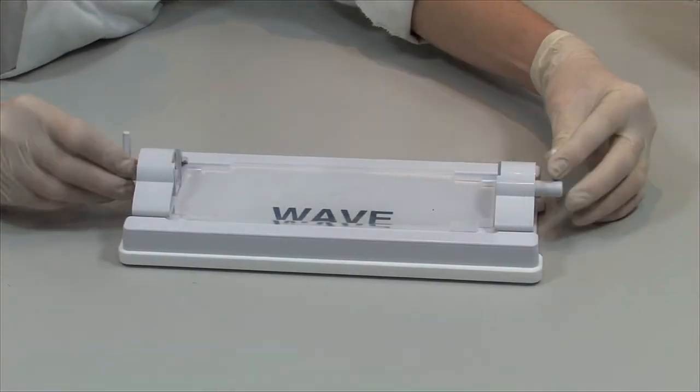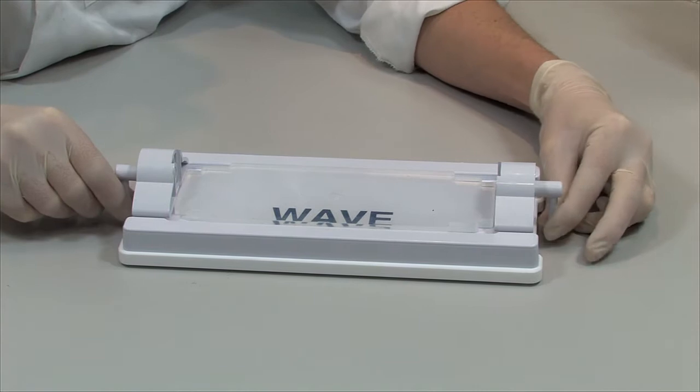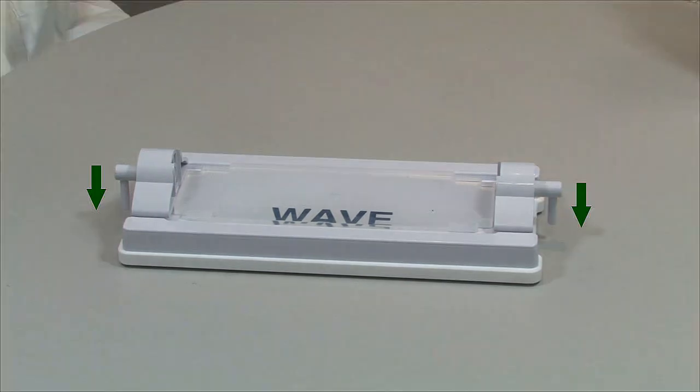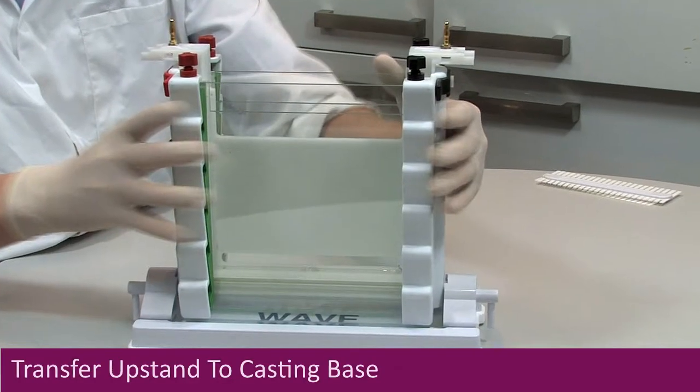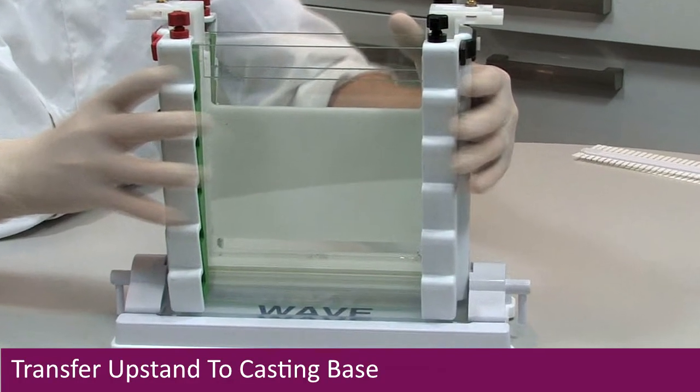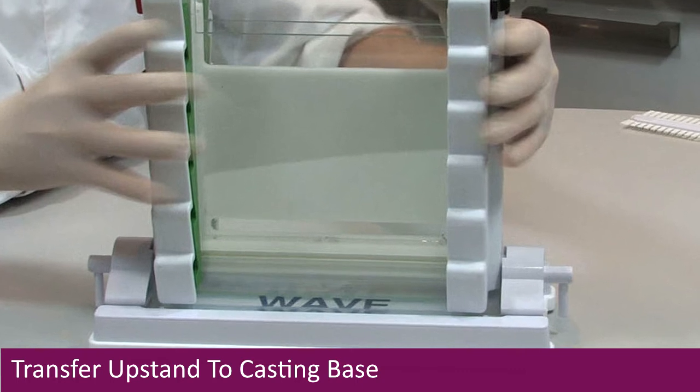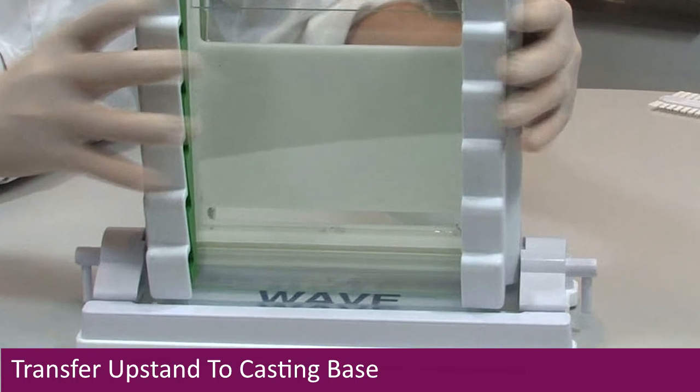Pull out the cam pins from the casting base and rotate them so that they point downwards into the lab bench surface. Transfer the upstand containing glass plates to the casting base, ensuring that the glass plates sit evenly on the ultra soft silicon mat.